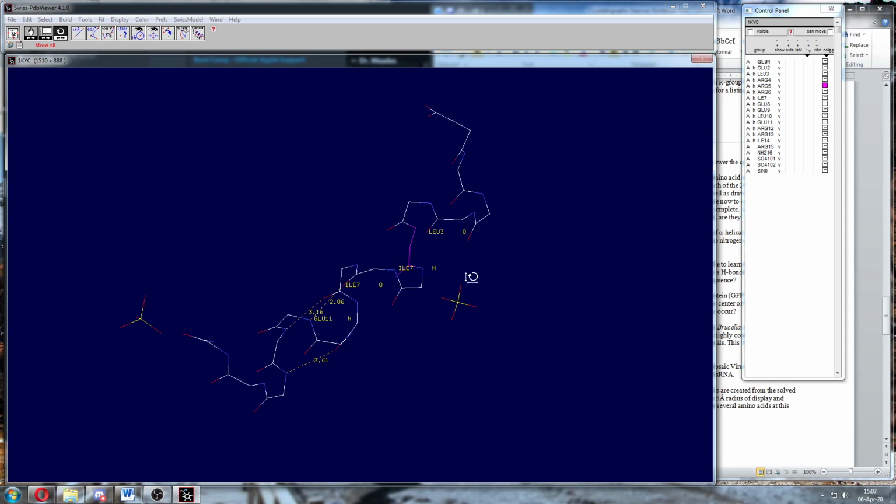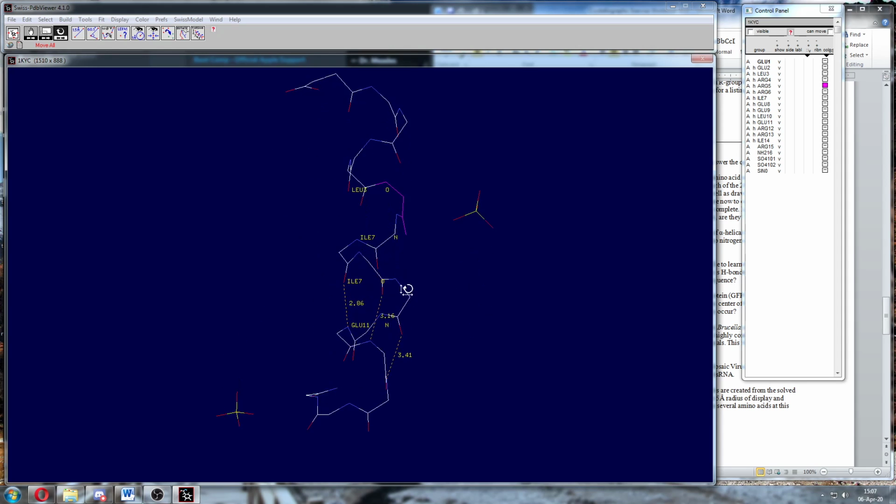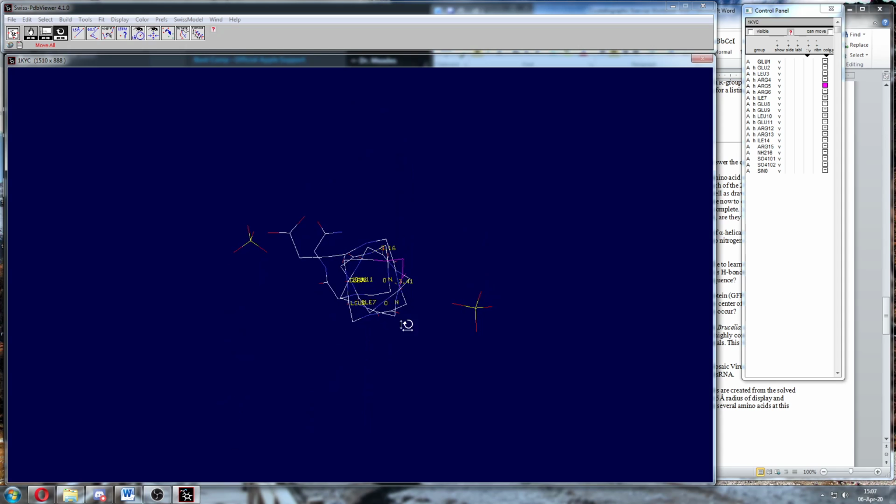Now if I were to take it and turn it on end, so you're looking down the barrel of this thing, there is no hole here, we're only showing a stick figure. But I'm taking it and turning it on end so you're looking down the barrel. Then I'm going to turn on the R groups one at a time. Okay, so I'm going to turn on the glutamate, there it is, sticking out. I'm going to put it at the very top, pointing up. So glutamate is pointed almost straight up.